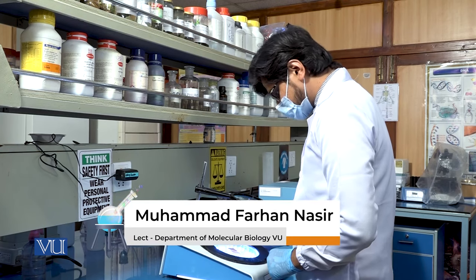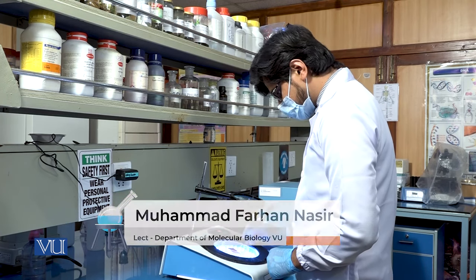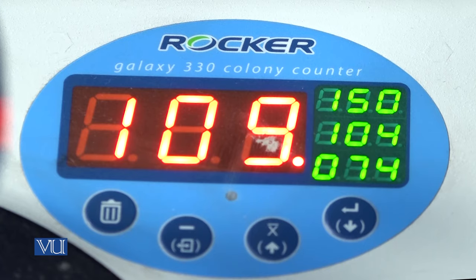After counting the number of colonies, it can be used to save the counting number for a maximum of three different plates.